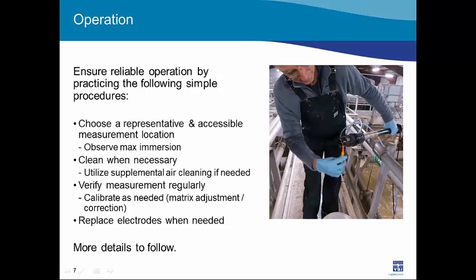I have a bullet there, observe max immersion. Generally, you want to keep the probes wet. They want to be in the water, but generally not more than 10 feet deep. They should be cleaned when necessary, and that's in the picture there. The graphic on the slide shows proper cleaning technique for an ISE probe.